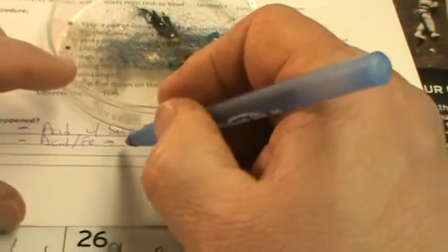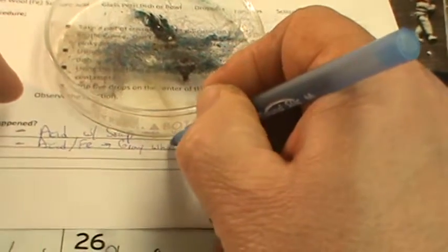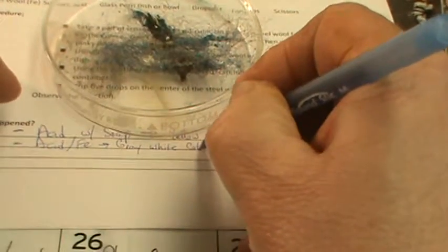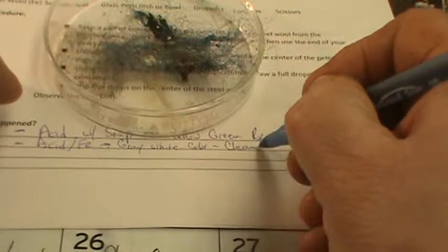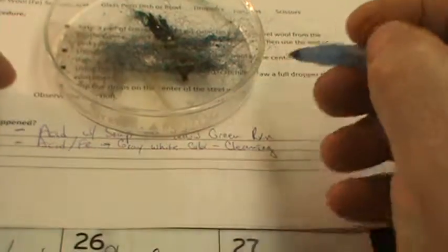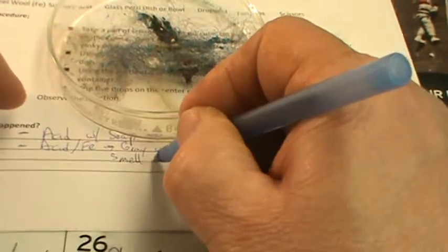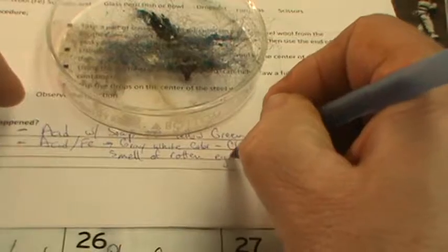But with my acid and iron, Fe, basically all I'm seeing is it turning a gray-white color. It's cleaning the steel, removing the oxide, the outer coating, and I can smell it. I am getting a smell of rotten eggs, which is the sulfur.